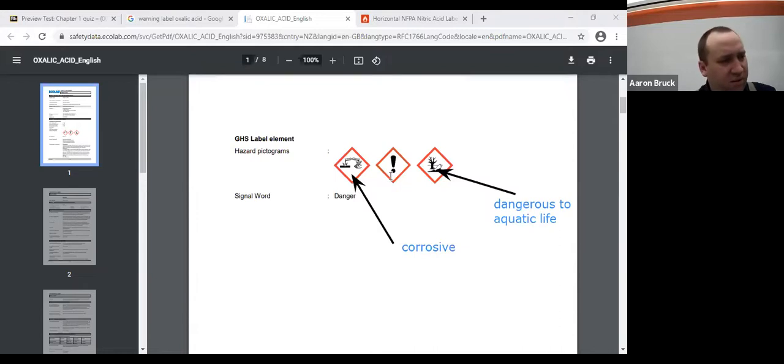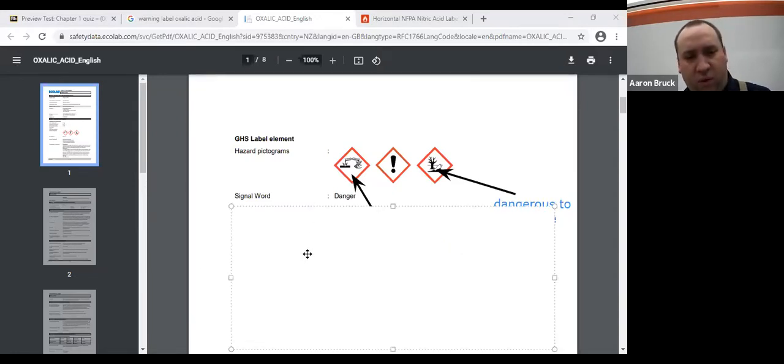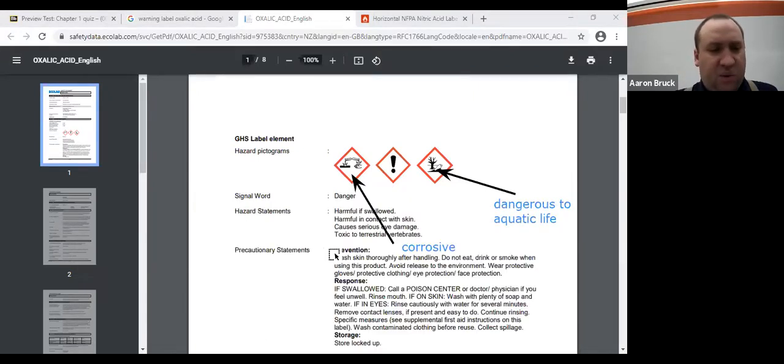Now, those of you who've been eating around the edges of the exclamation point here, this is where the MSDS would be really, really useful to us, because that exclamation point indicates a wide variety of different health hazards. But we know that it's probably some kind of an irritant. Chances are pretty good that skin irritation is going to be a real possibility, because we already know it's corrosive. Corrosives do have effects on your skin and your eyes. So if we pulled up the safety data sheet, this is what it would tell us. Harmful if swallowed, harmful if in contact with skin, can cause serious eye damage, toxic to terrestrial vertebrates, which would include people like us.